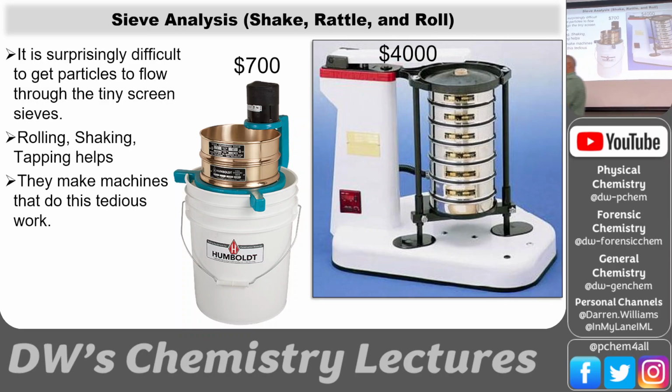And so here, you can look on the side to see their specs. So you put the sample up here in the top sieve, and it would be the smallest. Let's see, let me make sure. No, the more coarse would be at the top one.